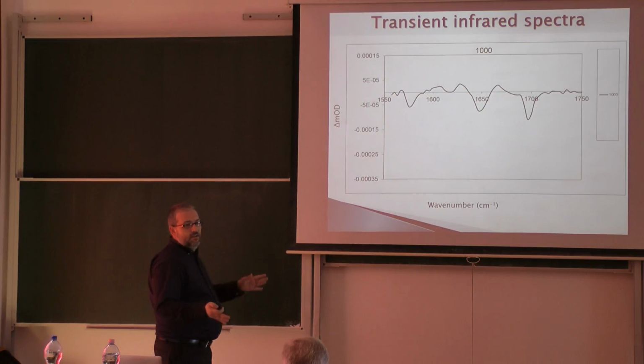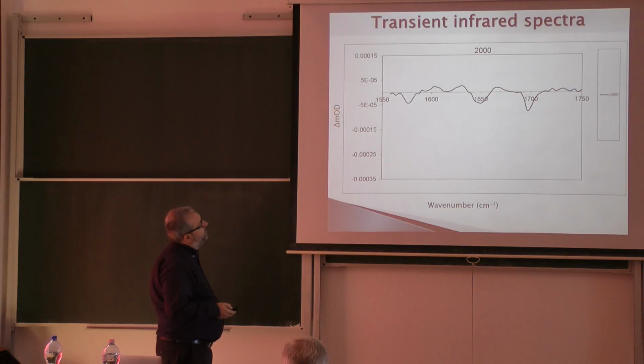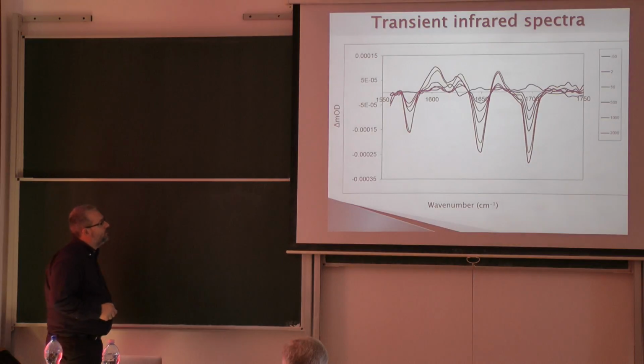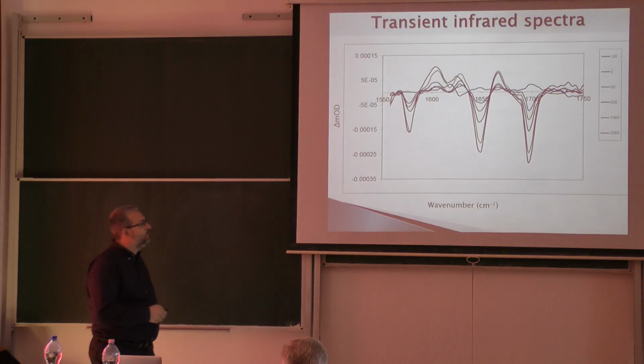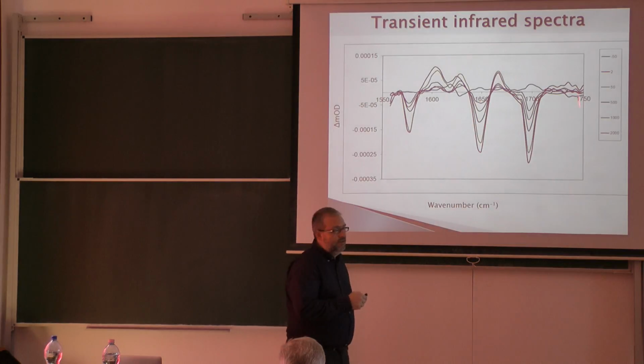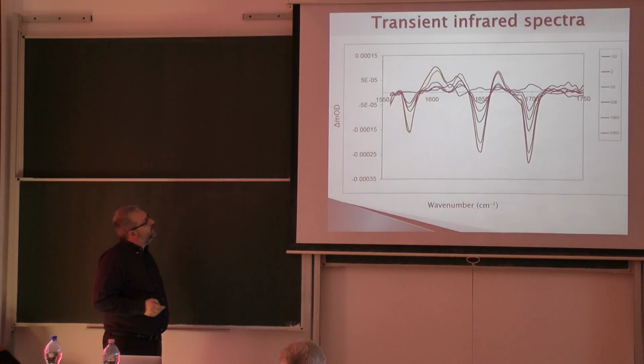So you can see it after excitation. This will decay back to 2,000 picoseconds, and basically these are all the spectrally measured all together. Now, of course, we have to know what these modes stand for. Otherwise, our data is worthless, basically.